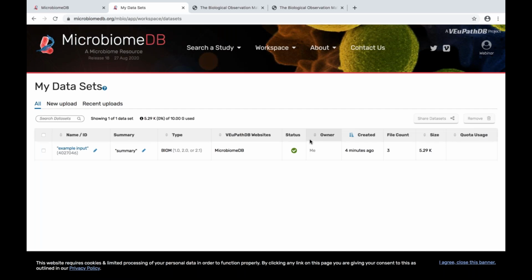Great. So there's a question, maybe while you're wrapping up here, either to you or to Dan. This was a question earlier as to whether you can upload your own data. And the answer is yes, if it's in a biome format. But also within that question, does it have to be only bacterial, for example, or can it be fungal data or other eukaryotic data? So as long as it's in this format we support, it's going to work.